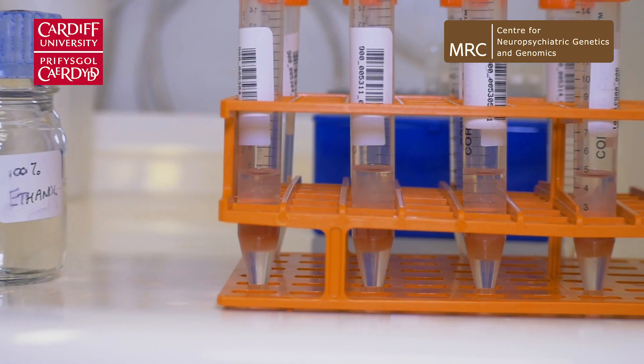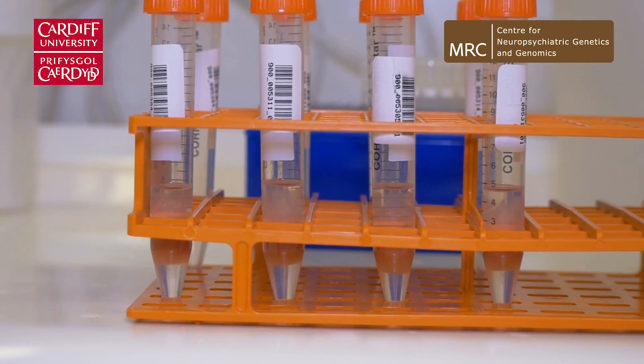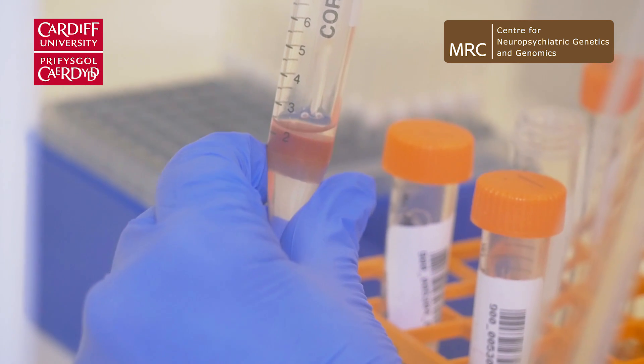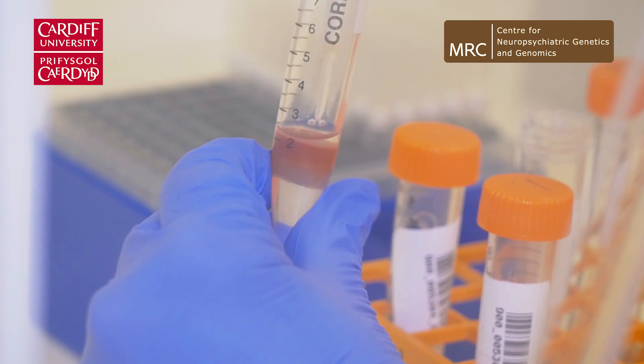The top layer is the aqueous layer — the water layer containing the DNA. Then you'll have a ready brown resin layer, and all that does is create a semi-solid barrier between the layers. And then the bottom layer is the chloroform layer.